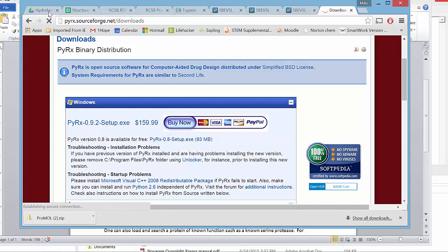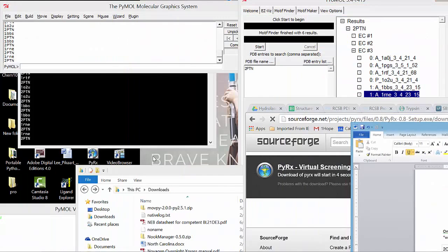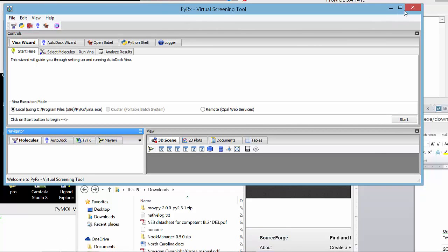PyRx has some very nice online videos that I will include in this document that I'm finishing up. But that should open and look kind of like this. So I hope that helps.